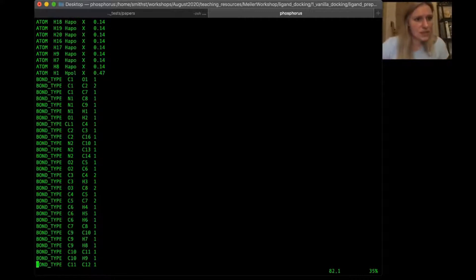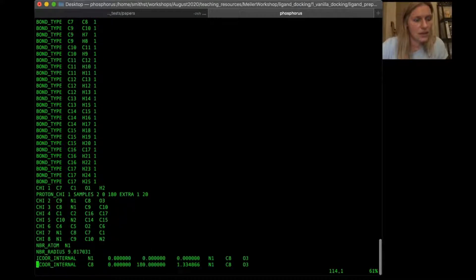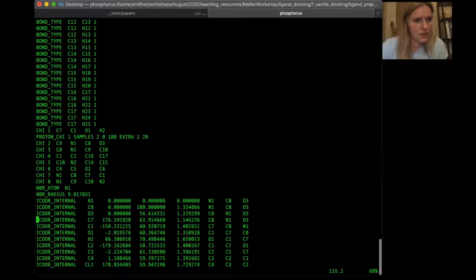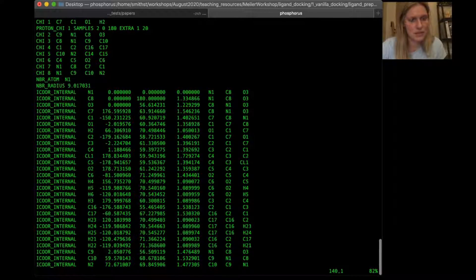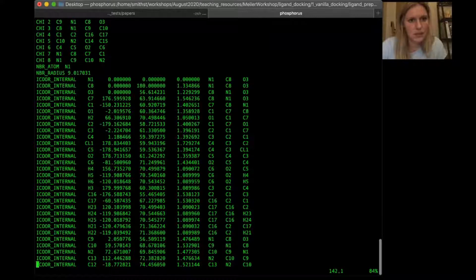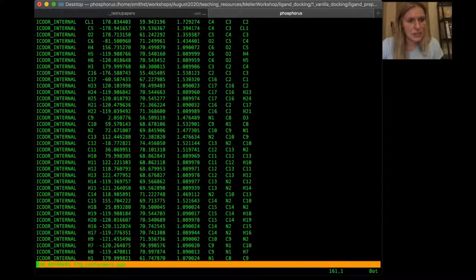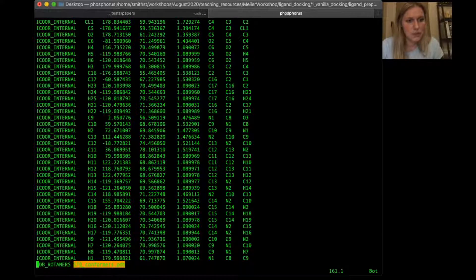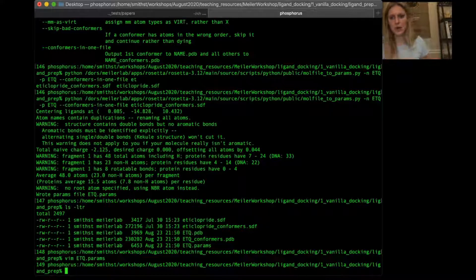The bond type here is how we designate internal coordinates and how things are connected. The ICOOR (internal coordinates) show how different atoms are connected, including dihedral angles between them and bond lengths between atoms. This very last line points to the PDB version of the conformer file, so that during high-resolution repacking stages Rosetta knows where to find those conformers. That's our params file overview.